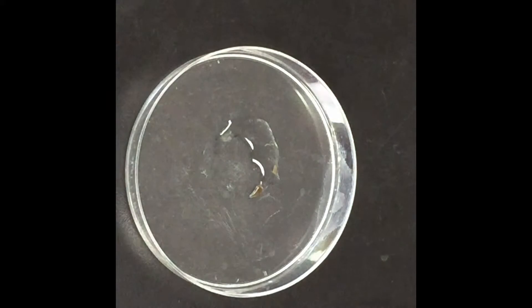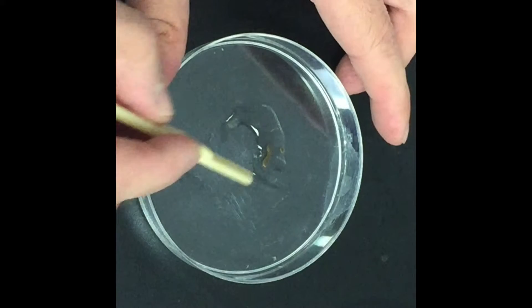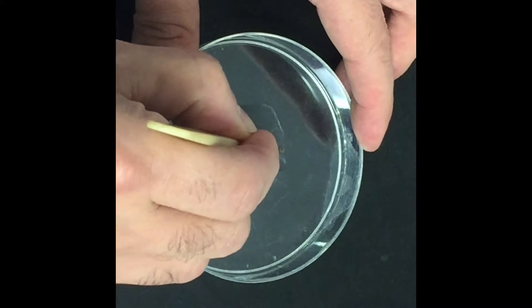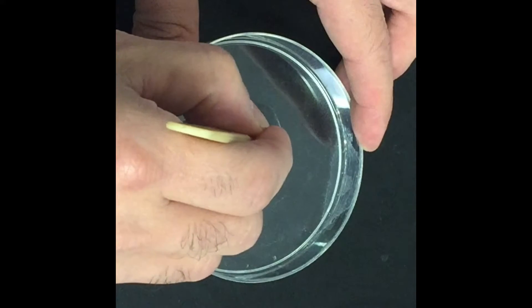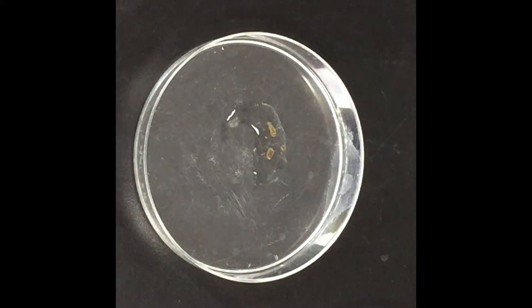I didn't cut him very much in half — I got a little piece of his tail. Let's see if that is enough to work. I'm wondering if I should cut a little more. So I cut him into thirds to make up for my mistake, probably with a bigger mistake, but let's see what happens.